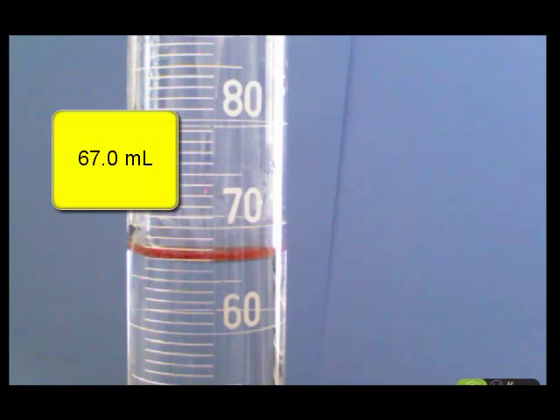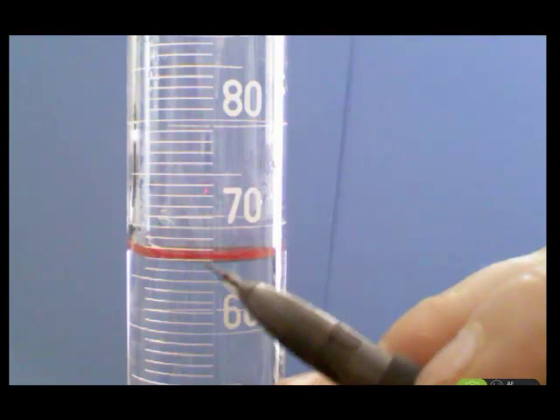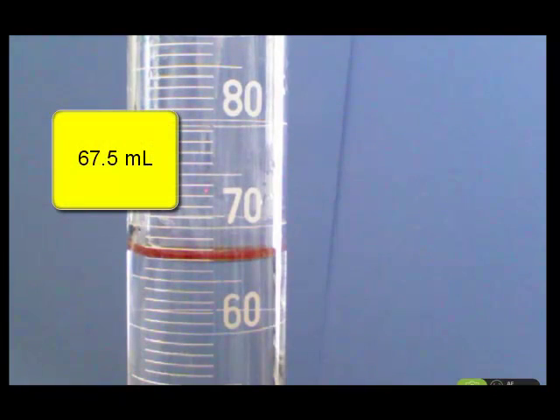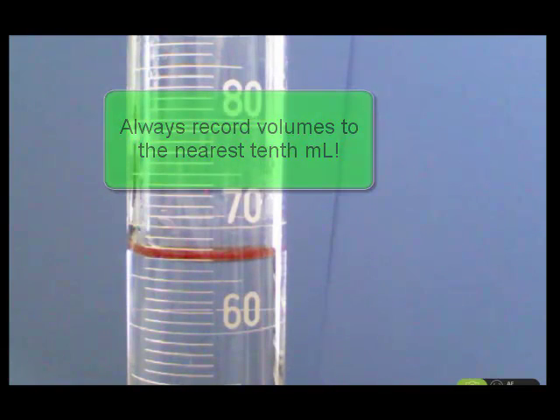Always record all volumes to the nearest tenth of a milliliter. Therefore, if it's in between these lines, let's say if it's between 67 and 68, you would record 67.5 milliliters. So you're always going to record every volume to the nearest tenth. If it's right on a line, make that tenth a 0, but you must do that for every recorded volume that you do.